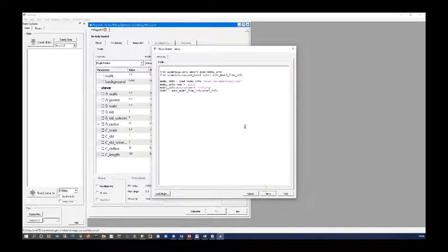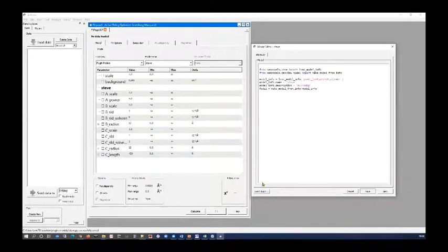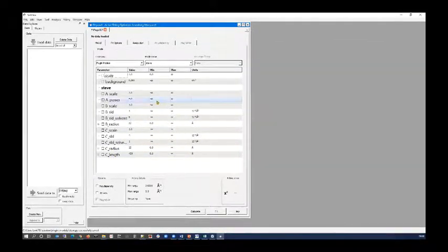Because I already had Steve loaded into the fit page there, you might have noticed something just happened. What's happened is that it's added on the cylinder parameters at the end. So again, we have the power law parameters prefixed with A, the sphere parameters prefixed with B, and now we've got the cylinder parameters prefixed with C.